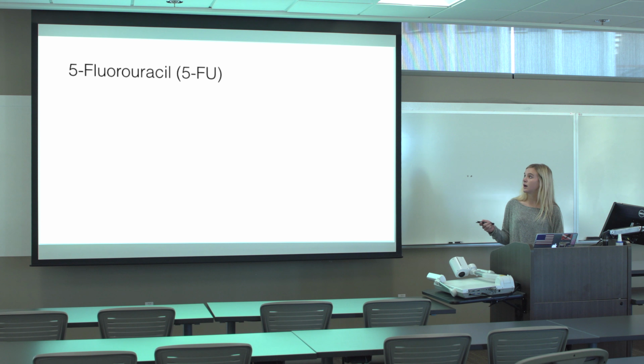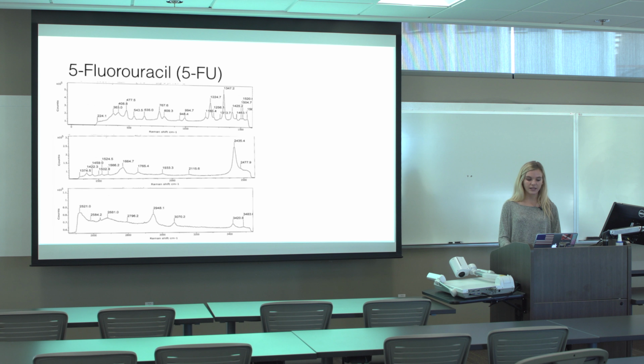Now what we're working on is taking collections of 5-fluorouracil. Here is a full spectra of 5-fluorouracil at 560 through 635 nanometers, and this is the structure of 5-fluorouracil. 5-fluorouracil is right now being used in a lot of chemotherapy drugs. And we have the idea that we can detect if fluorine can make its way into the tumor.